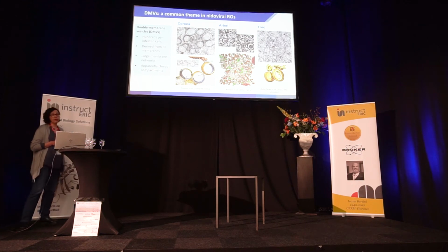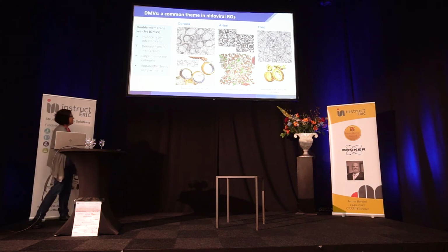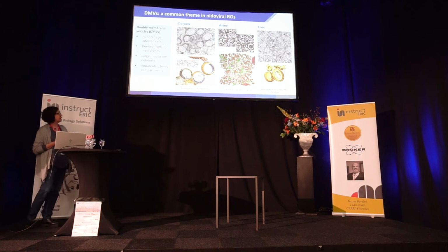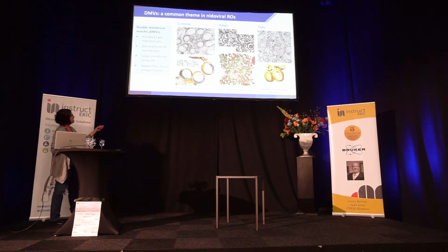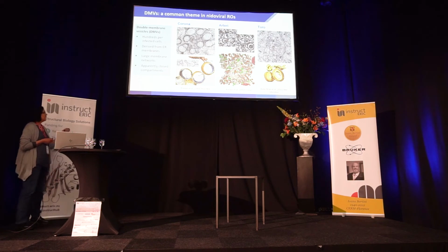There are hundreds per infected cell. They are derived from the endoplasmic reticulum, with which they have connections, and they also interconnect through the outer membrane, forming together a large reticulovesicular network. This is common for corona- and arteriviruses that we study, and recently it has also been shown for toroviruses by the group of Dolores Rodriguez. Interestingly, and this will come later, in this type of preparations, which are resin-embedded samples, the inner membrane seems to define a closed compartment, with no openings to the cytosol.